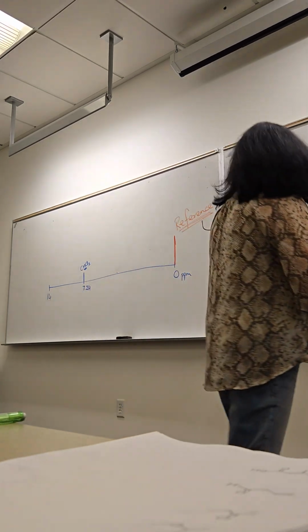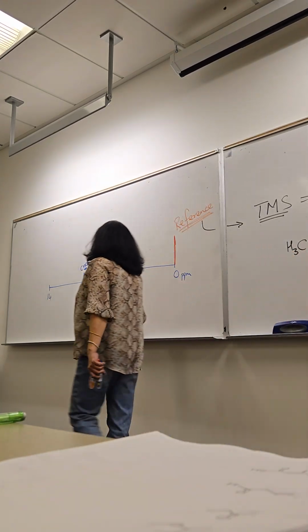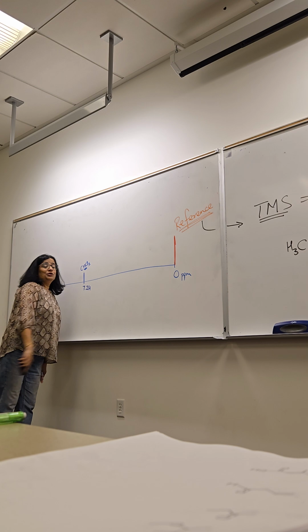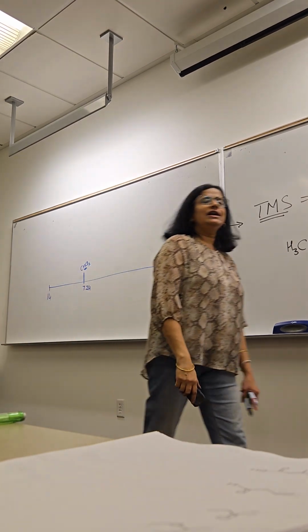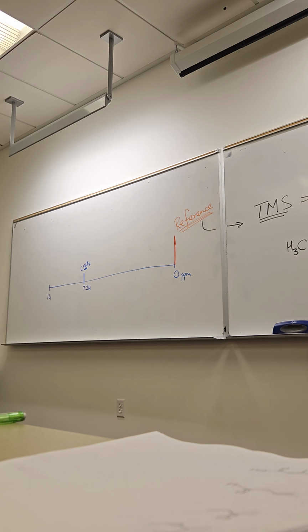If you're using a polar solvent, you can have deuterated water, deuterated methanol. In fact, nowadays there's a huge variety of deuterated solvents for NMR.